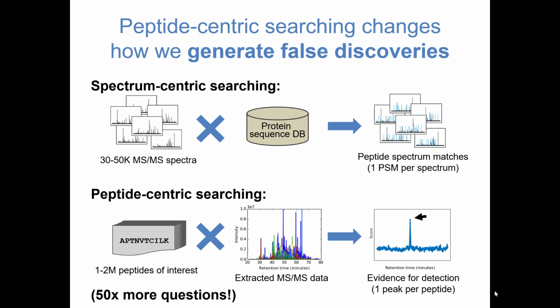That's in some ways easier to ignore or separate out, because it's going to provide less signal than the true time point, since you're not going to have very many fragment ions that match to it. So from a quantitative perspective, it might not affect the statistics nearly as much. Does that make sense?